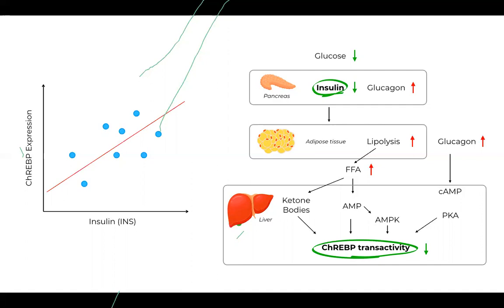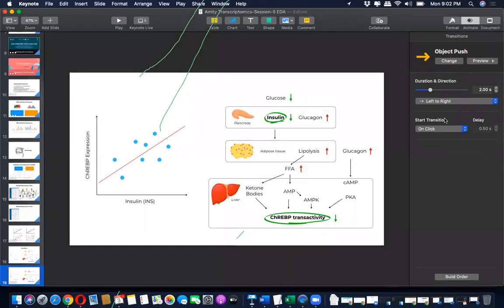These two are related. Now I think you understand how things are correlated, how samples are not correlated, and that there is an effect of expression of one gene on the other, because they are correlated.